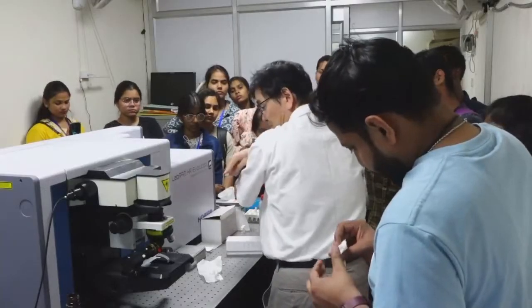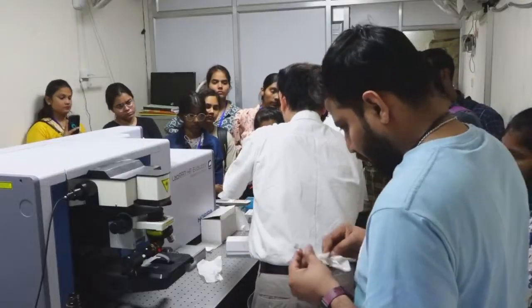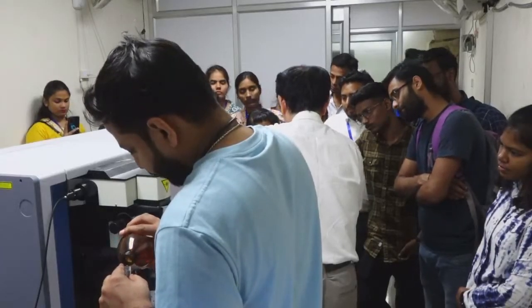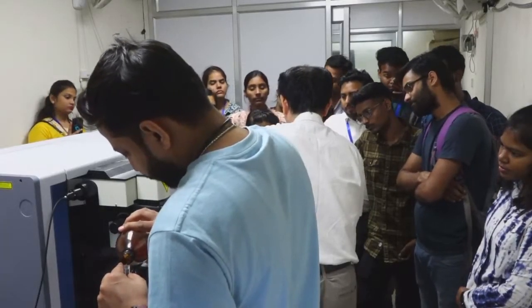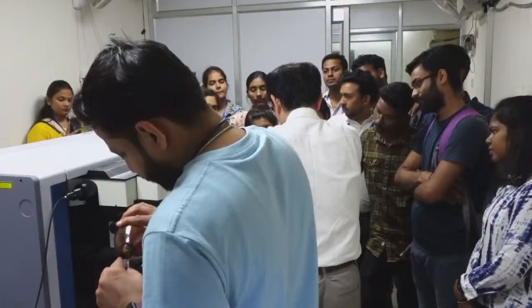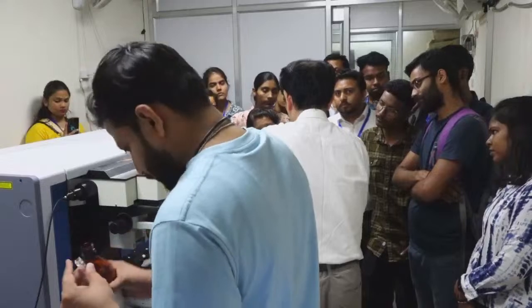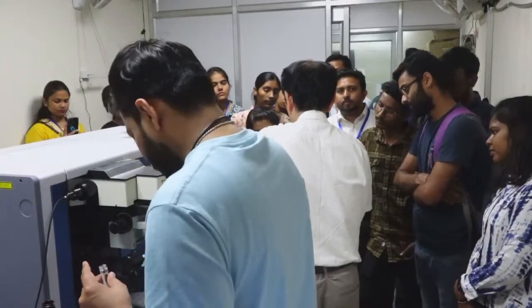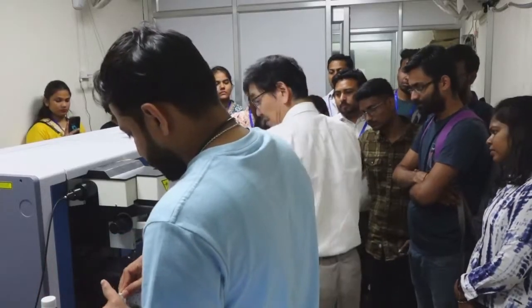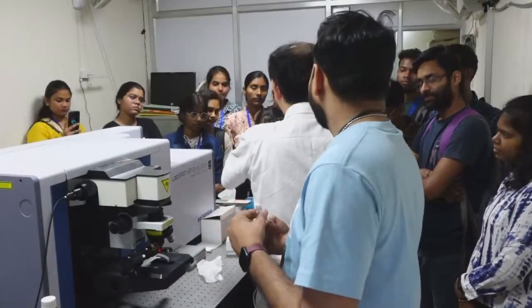In this microscope case, this objective lens serves as a focus lens as well as a signal collection lens. So the scattered light is collected by this lens and delivered upward. The laser beam comes from the top and the signal returns along the same route. In this sense, this is a backscattering configuration. But anyway, this is very convenient too because the laser focus can be very small.